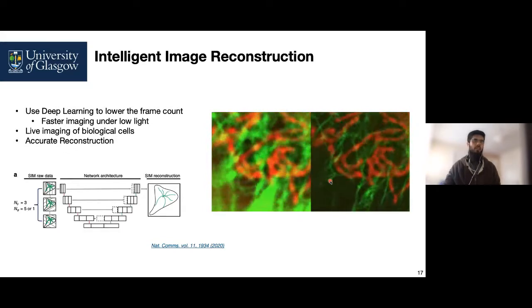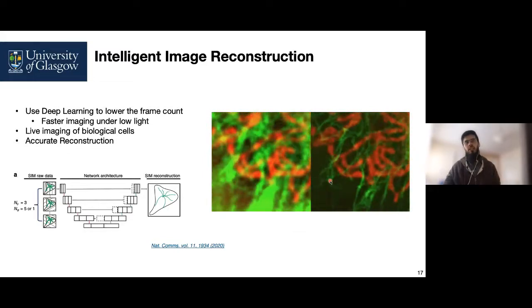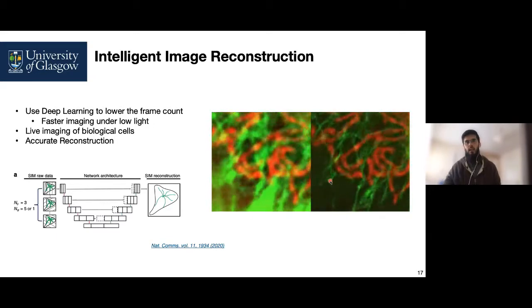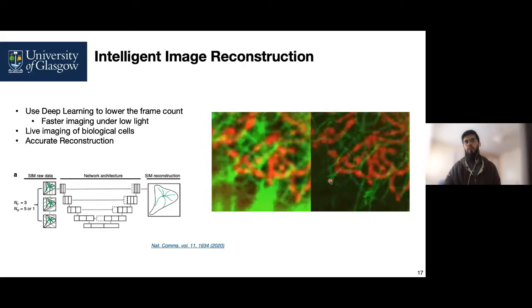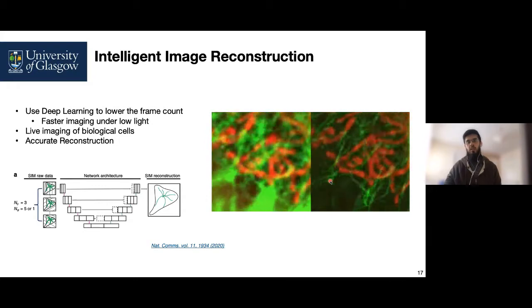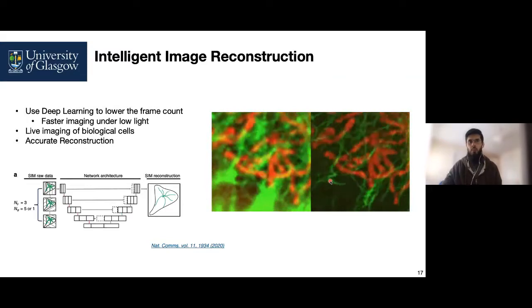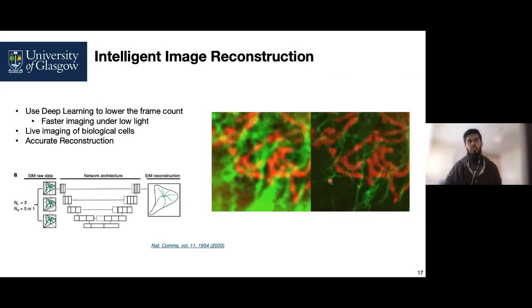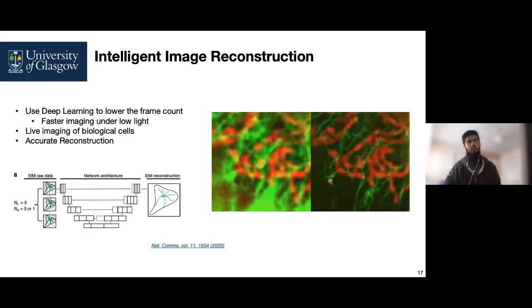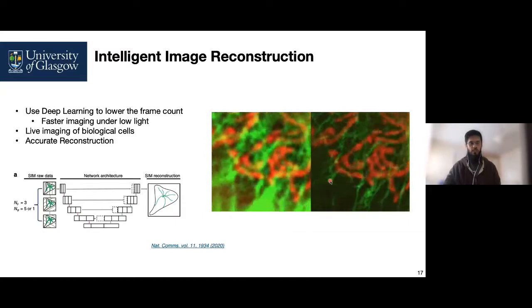So the attraction of this is the smaller number of exposure samples that we would require, and that will enable even faster structured illumination microscopy techniques. We are now able to image biological samples live, but these sorts of advancements will enable a much clearer picture in future.